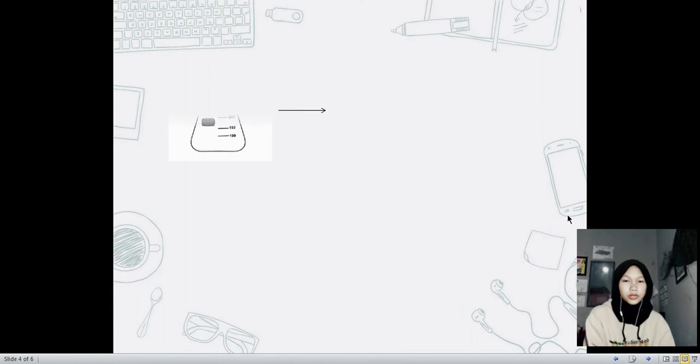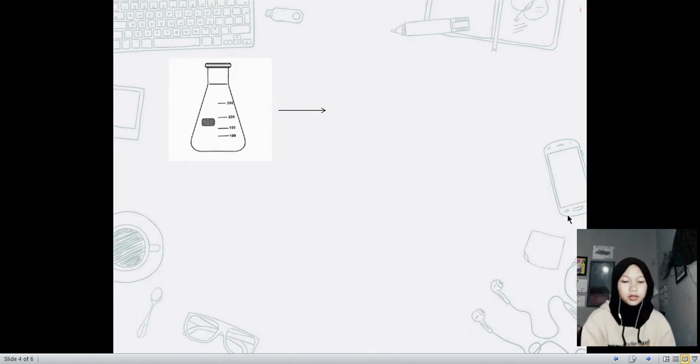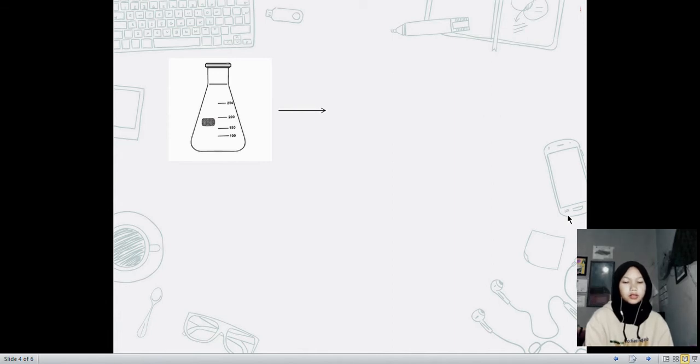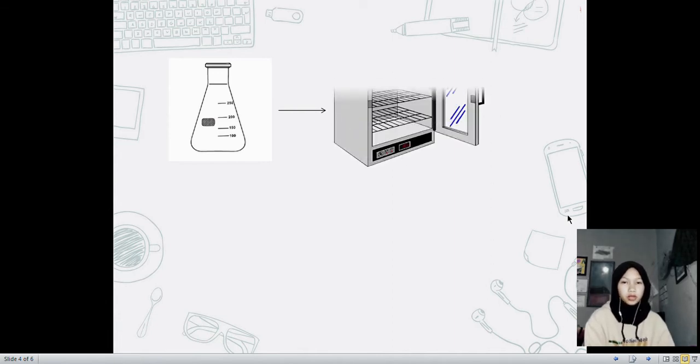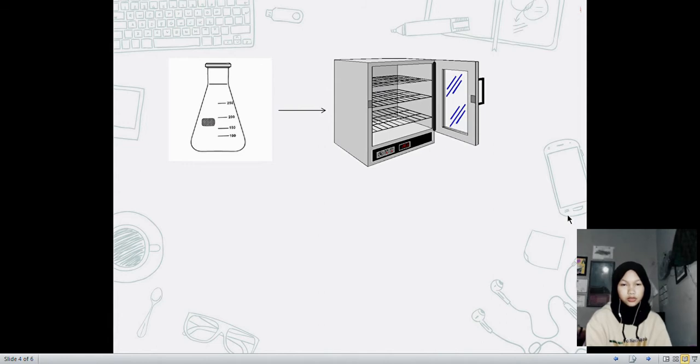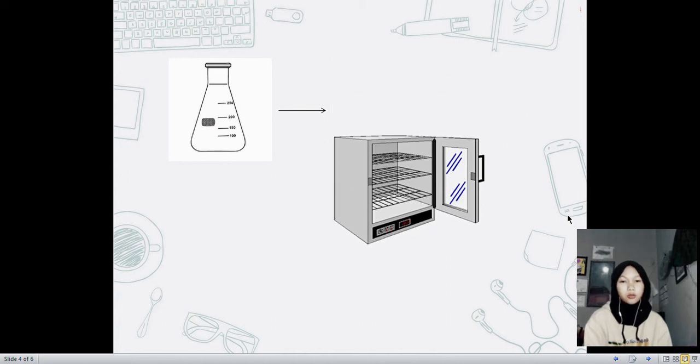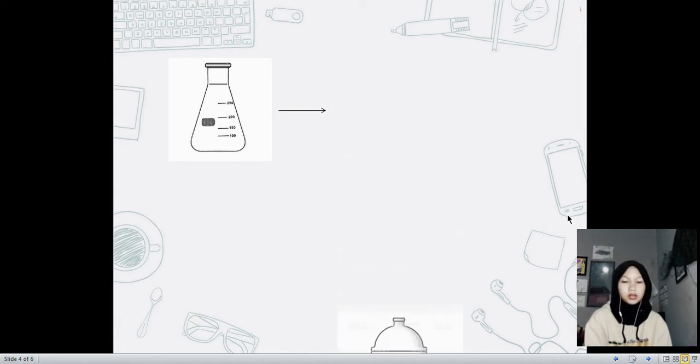First thing that we have to do is put the Erlenmeyer flask to the oven at 103 degrees Celsius to 105 degrees Celsius. Put it in the desiccator and weigh the Erlenmeyer flask.